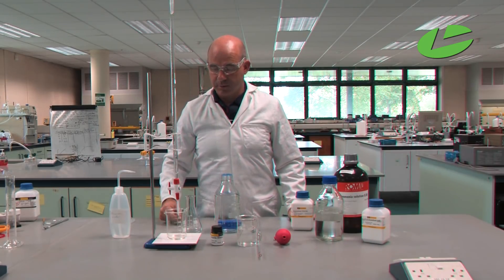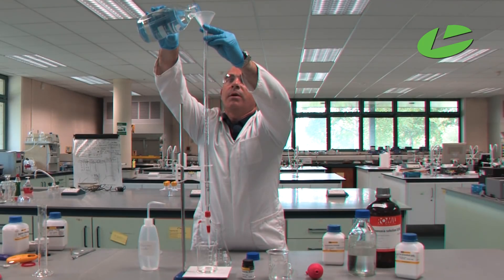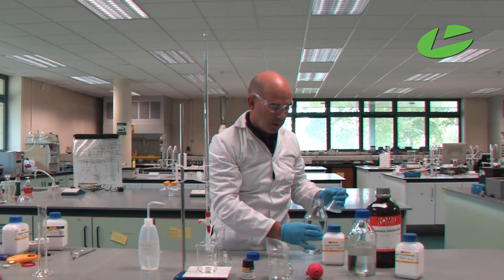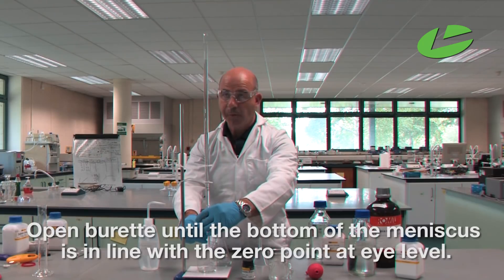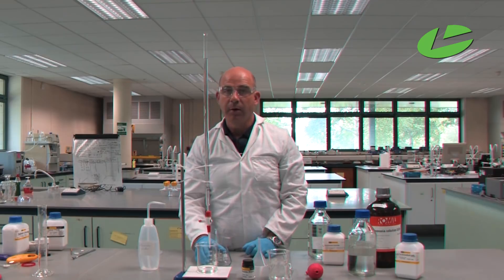Now that the rinse has run through, we can fill the burette with the EDTA solution. Pour the EDTA to above the zero point, then remove the funnel before starting the titration, because any droplets on the bottom of the funnel can drop in and give false readings. Open the tap to fill below the tap, bring the bottom meniscus in line with the zero point. The burette is now vertical and ready to be used.